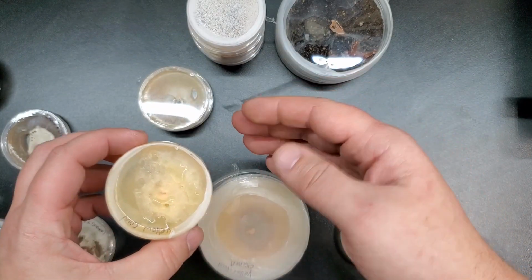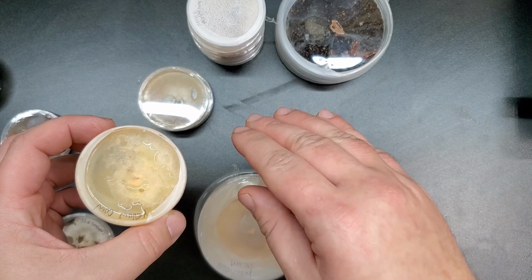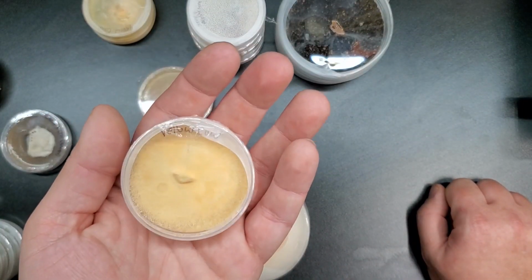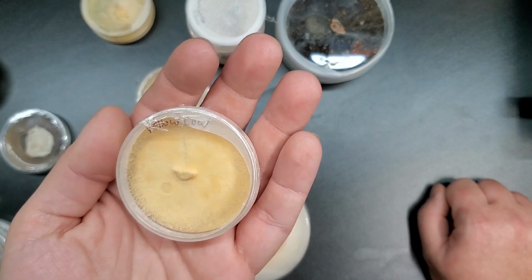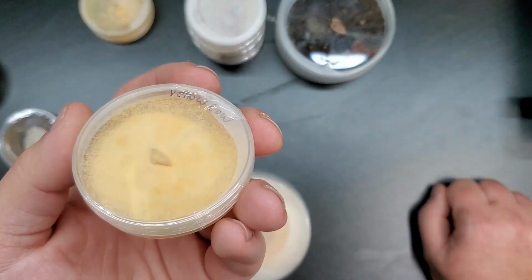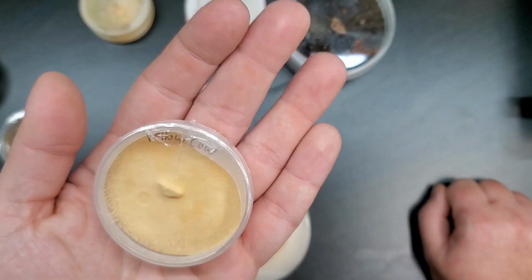I modified it a little bit and I put an insulating piece of styrofoam on the bottom, and then I put some plastic on top of that, and then I put a new petri dish that I inoculated with some yellow chicken of the woods mushrooms. You can see here this one turned out fantastic. This one I'll probably use for experiments and just kind of playing around with chicken of the woods mushrooms to see what they like to grow on and what I can and can't do out here.